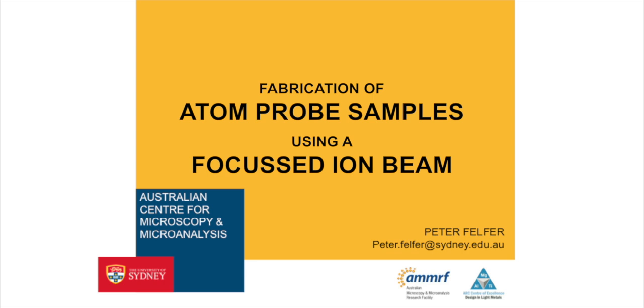We have a strong focus on atom probe tomography here, and I myself have been specialising in making atom probe samples using a focused ion beam, which includes a whole variety of projects. For a recent workshop, I was asked to give a comprehensive overview on how to actually do that, with a focus on things that you wouldn't be able to find in a publication, like settings on microscopes, how to move stages around, just a basic rundown, just to give an introduction for someone that's just starting out to do that.